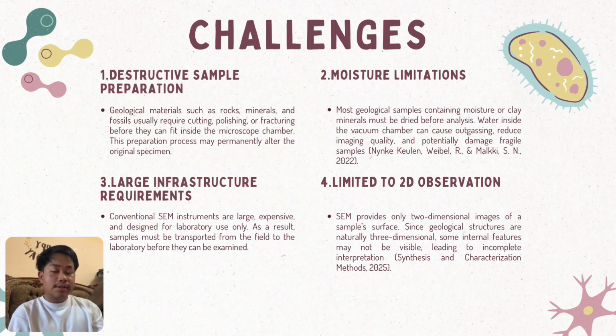Third, SEM instruments are expensive and require specialized laboratory facilities. Finally, SEM mainly produces two-dimensional images, which do not fully represent the true dimensional structure of the sample.